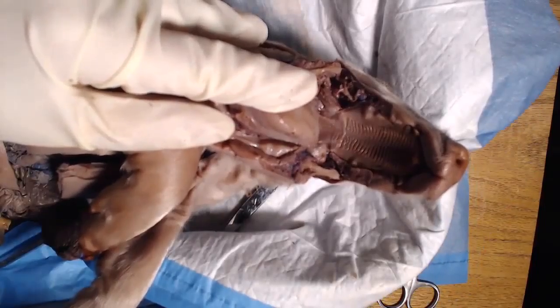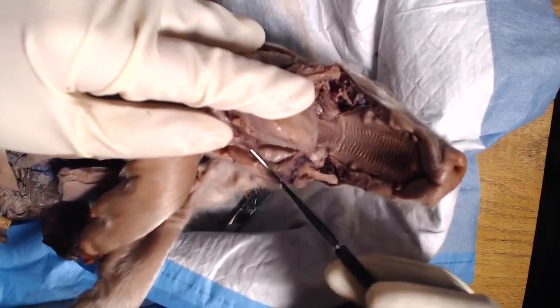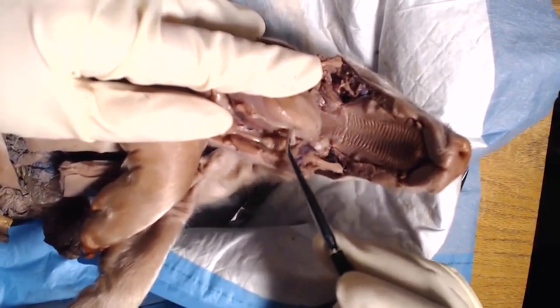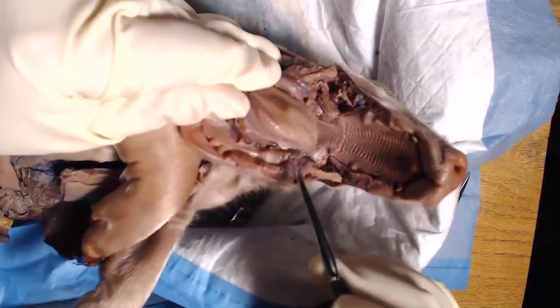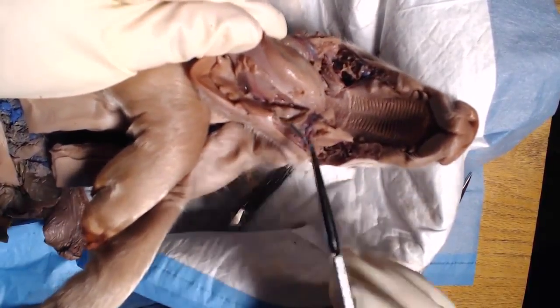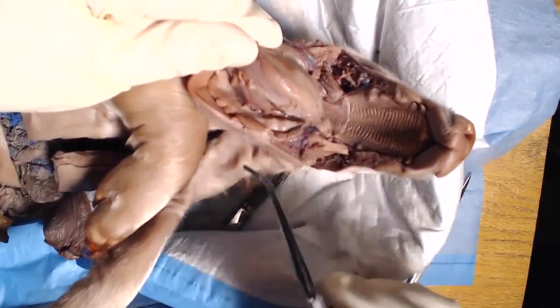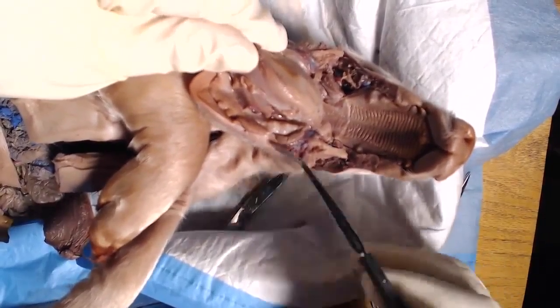All right. Then I'm going to take my probe and push some of that tissue that we cut through to the side so we can see the gland better. At this point, you should be able to see a spongy substance right under that tissue. Now what we're looking for here is the sublingual gland, which makes sense because it's right under the tongue.